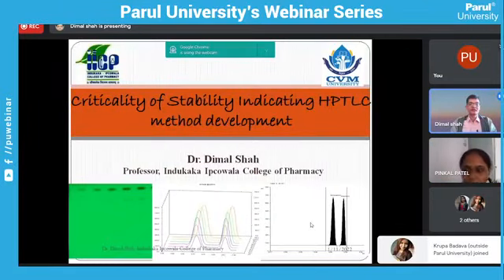So the topic that has been given to me, or the topic that I have selected, is criticality of stability indicating HPTLC method development.